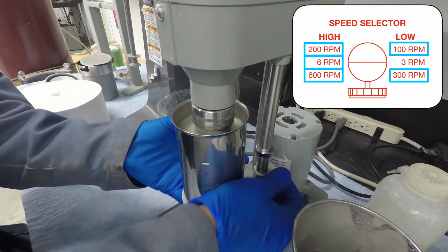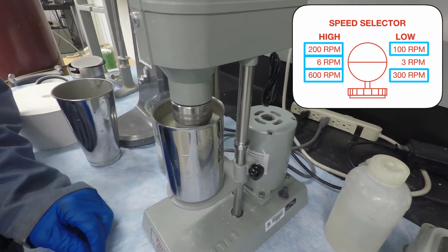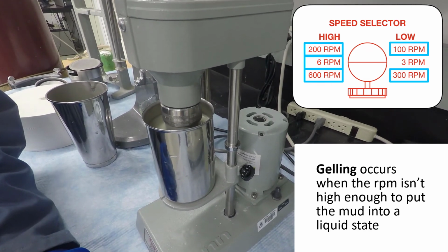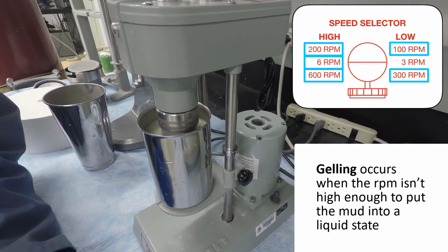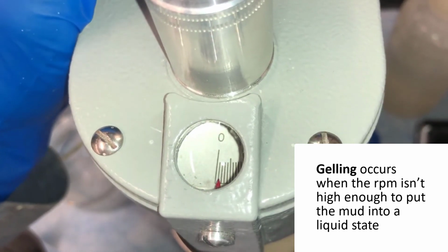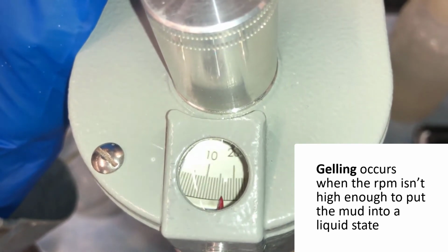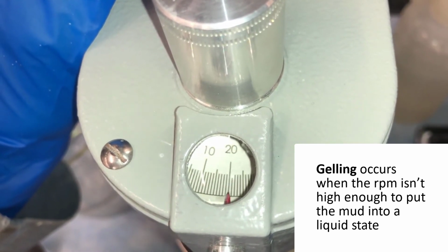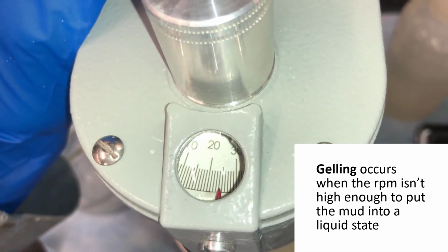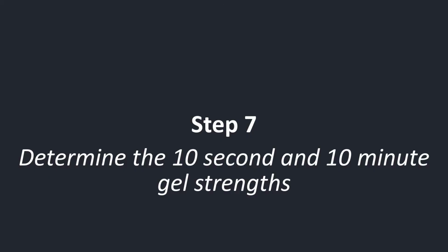Keep in mind that the 6 RPM reading seen could be higher than the 100 RPM reading. This would be because of the effect of gelling. Gelling occurs when the RPM isn't high enough to put the mud into a liquid state. If the mud appears to gel, discard the value. Only use the value if it enhances the data.